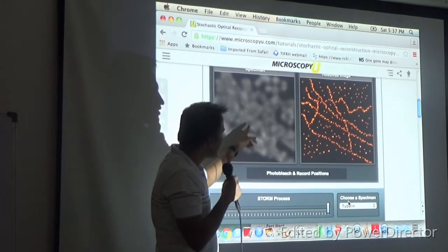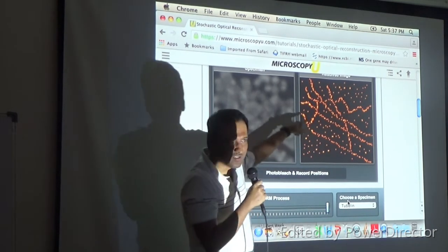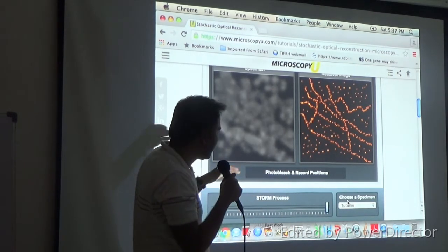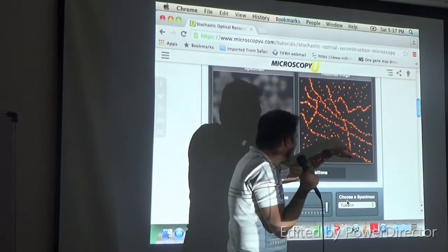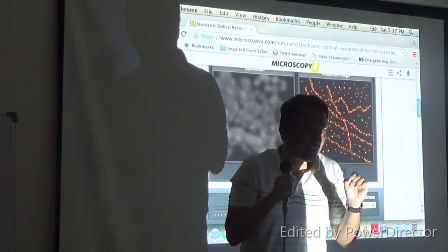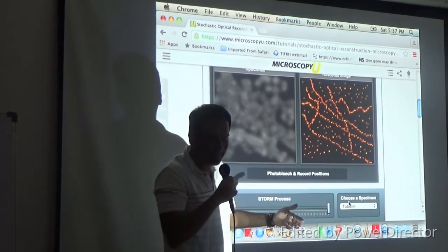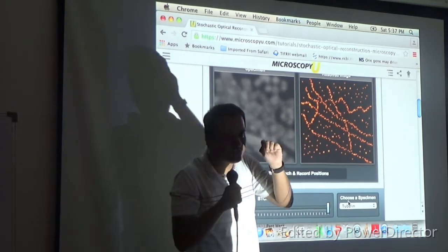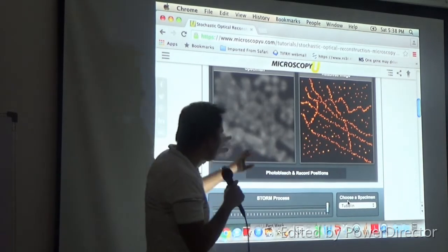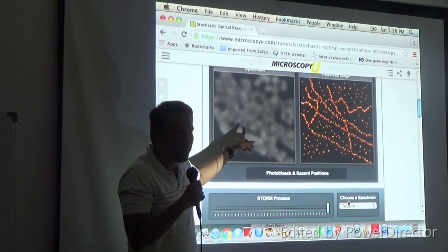You are seeing, this was your original image, right, of the microtubules. Now you can see the individual strands of the microtubules, which are 25 nanometers thick. In this method, they come out about 14 nanometers or so. But the point is that you are just localizing each individual molecule. And by doing this repeatedly, I could get the points of each individual molecule that is emitting. And from that I got this image, right? And that image does look better than this, right? It looks sharper than that.